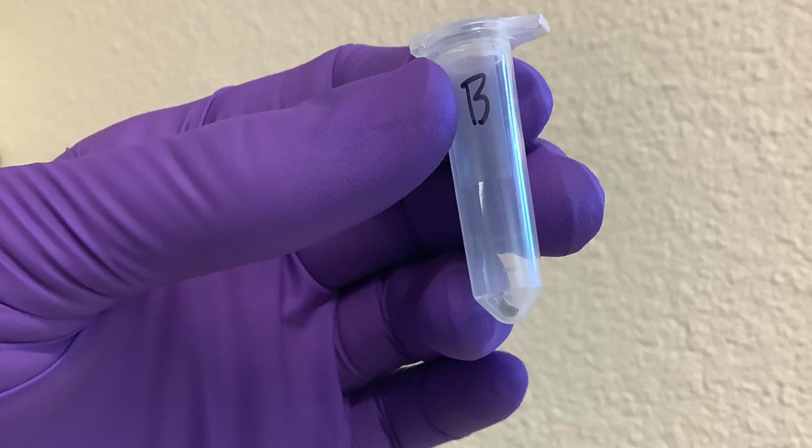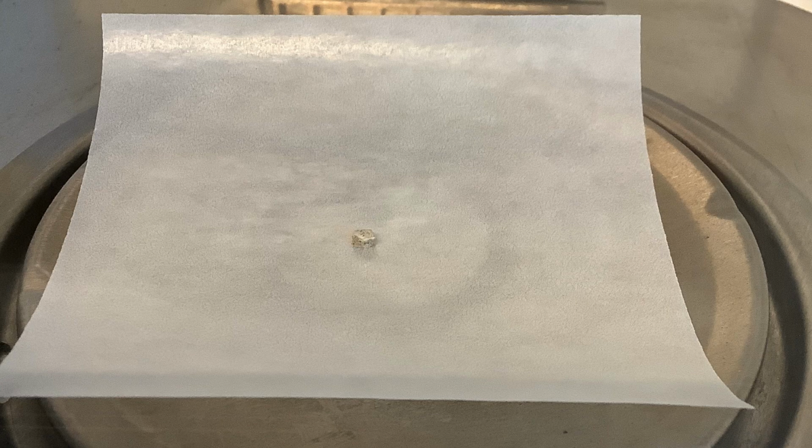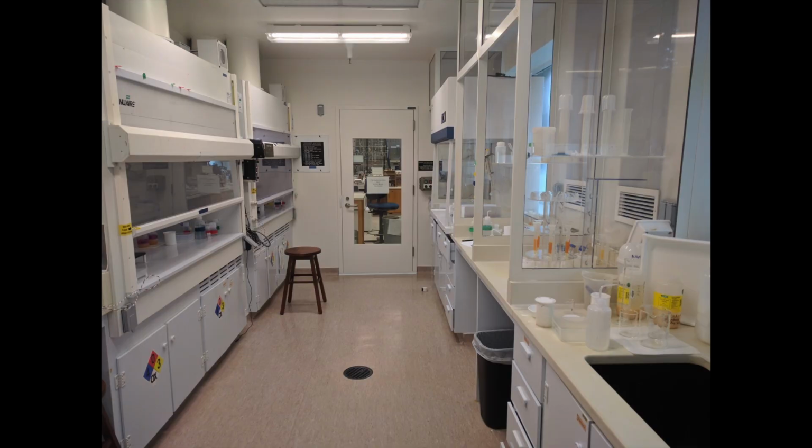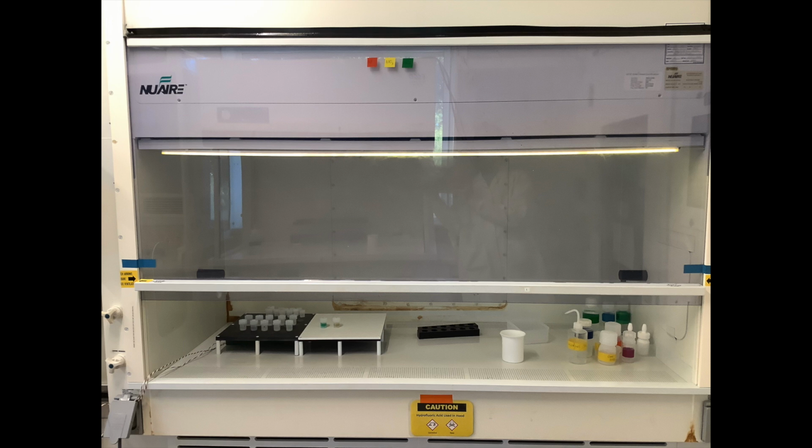Here's our crushed sample from before. We'll start by storing them in pre-massed vials and measuring the mass of these with a sensitive balance. Alternatively, we can mass our fractions directly on tared weighing paper. From here on out, we will be doing the rest of our chemistry in clean lab spaces. I will be working either within a laminar flow bench, which blows a sheet of filtered air to keep the workspace free of dust and debris, or I will be working within a laminar airflow fume hood, which pairs the cleanliness of a laminar flow bench with the ventilation of a fume hood to protect us from hazardous acid fumes.